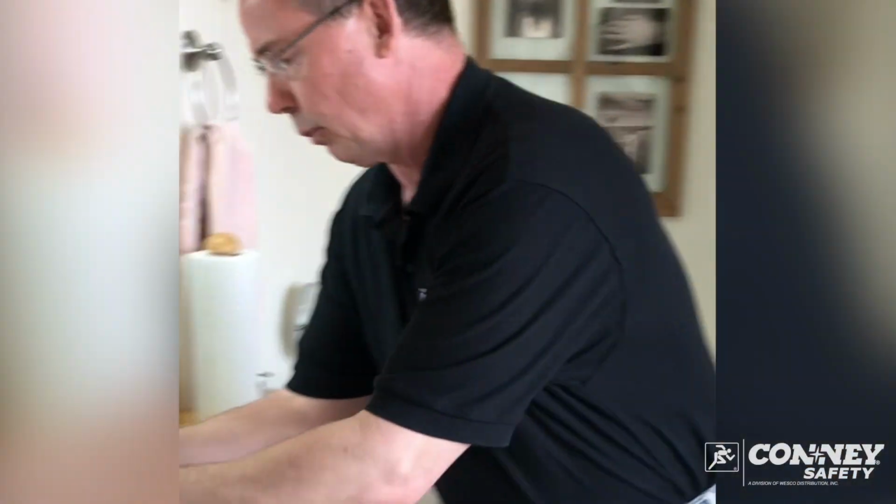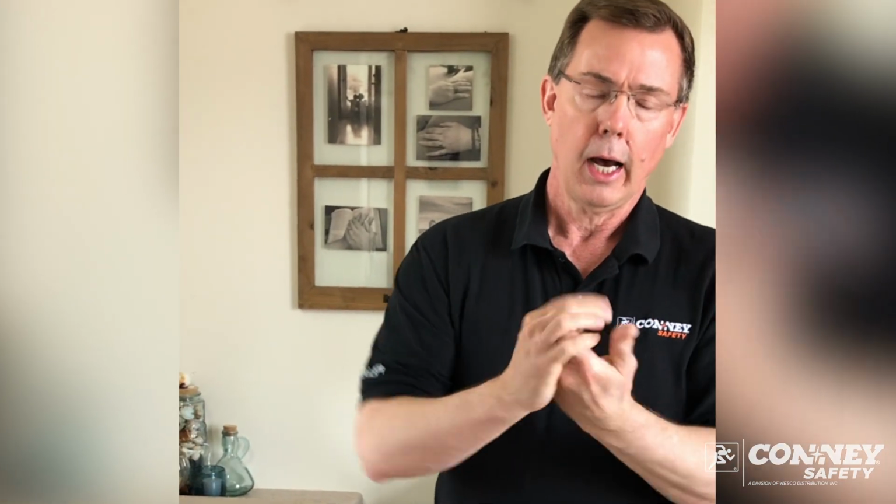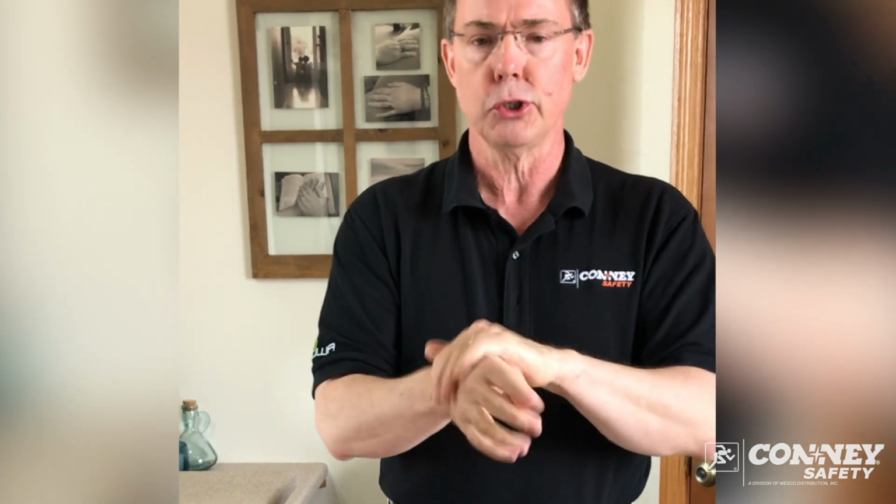and can throw that out. Very important to remember that when you are done, you either need to wash your hands or use a hand sanitizer. And the biggest thing is, what are you going to be touching afterwards? So just be aware that any other surfaces you may touch could be contaminated. So just be aware of that and be safe.